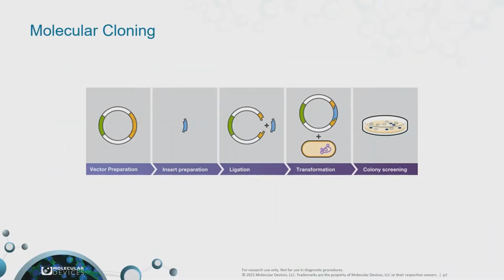Molecular cloning is a valuable technique utilized by many molecular biologists to study biological traits through in vitro gene copying. The traditional molecular cloning process involves the isolation of DNA that is ligated into prepared vectors, such as plasmids containing unique restriction sites for cloning in foreign DNA and antibiotic resistance genes. Assembled DNA plasmids enable the transformation of microbes, such as competent bacteria, with the defined DNA sequences. As the bacteria multiply, so does the inserted foreign DNA, which is typically screened via colony picking and confirmed via DNA analysis.